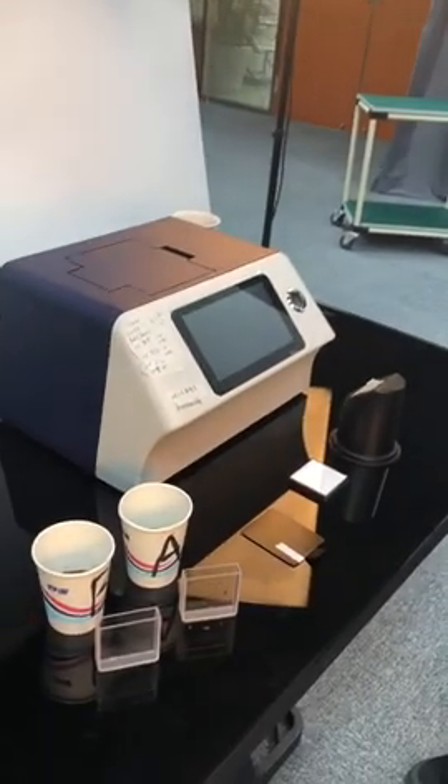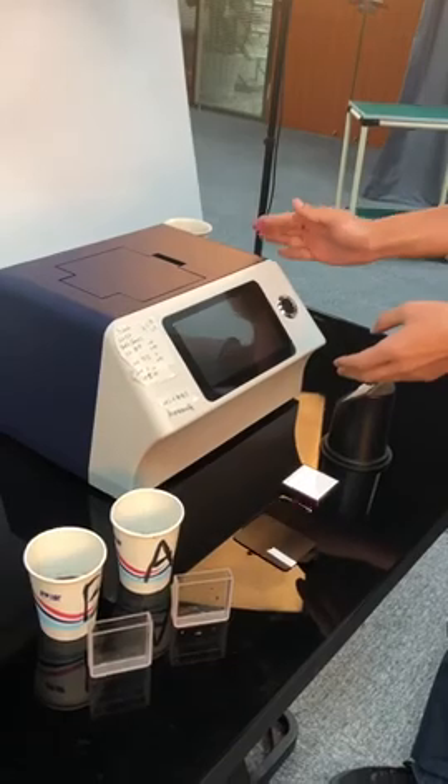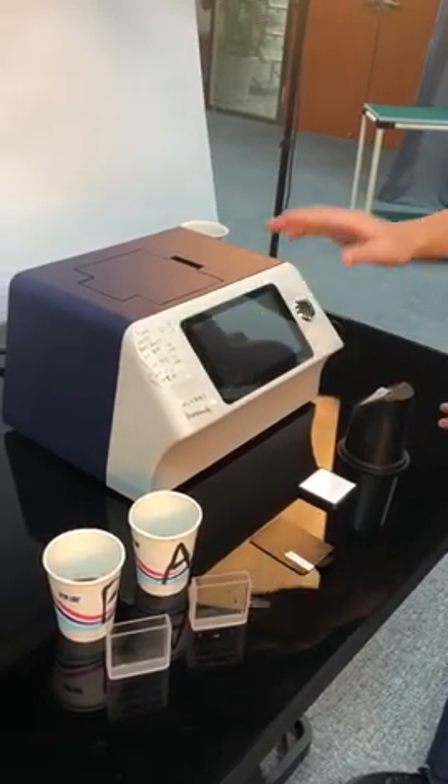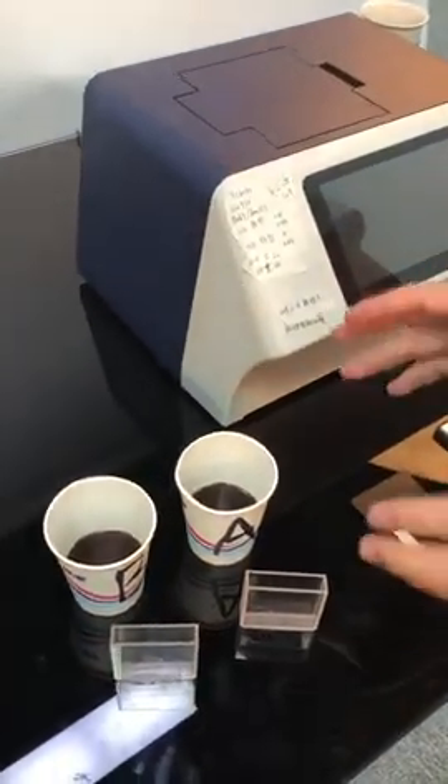Hello, this is Forrest Li. Here I'm going to show you how to use our latest bench-top spectrophotometer YS6060 to measure the color difference of the liquids.